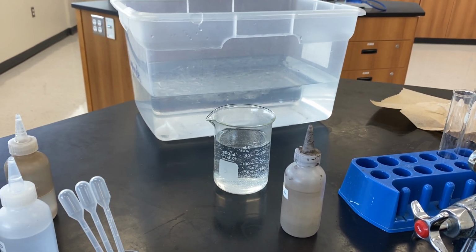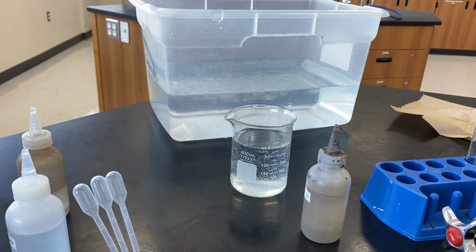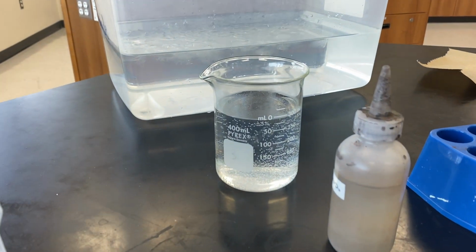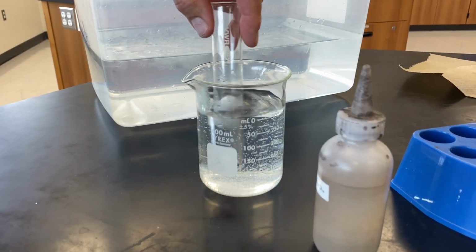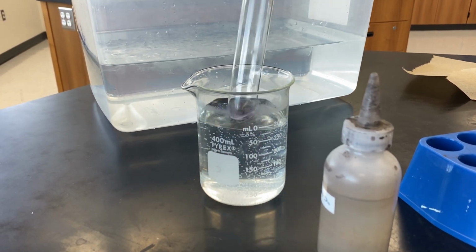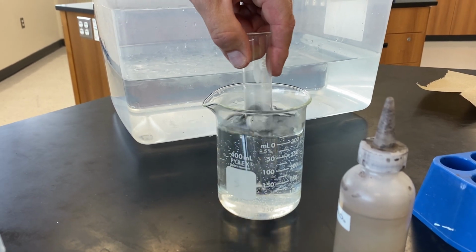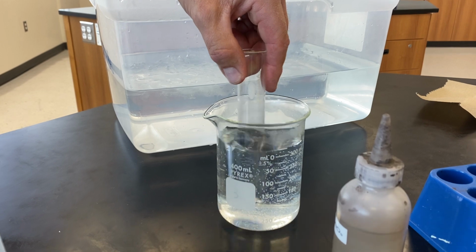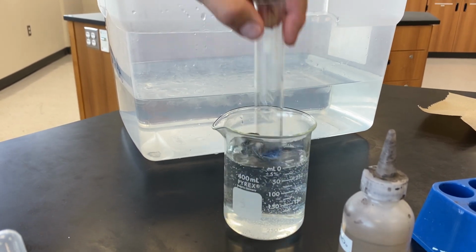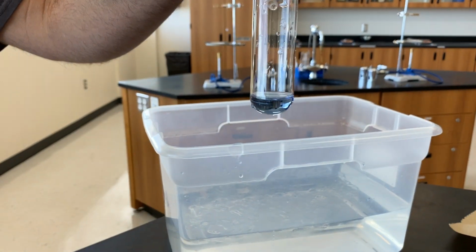Now in step 9, we're going to take the solution, and actually in step 10, we've already got our hot water. Step 10, we filled a beaker with hot water. Now we're going to submerge the test tube in that hot water. Oh yeah. It's going. It's going. I love it when chemistry works. Oh yeah, that's great. All right, so that's warmed up. Good. So on the camera, that may look a little purplish, but that is that blue color.